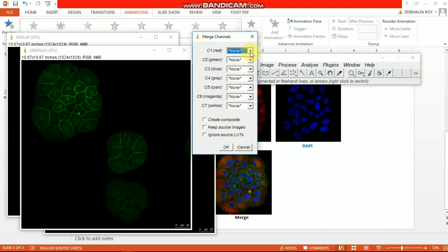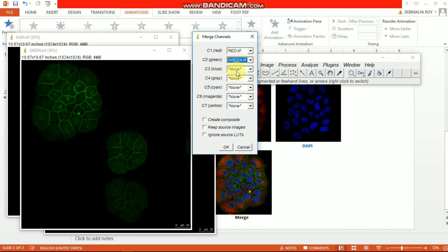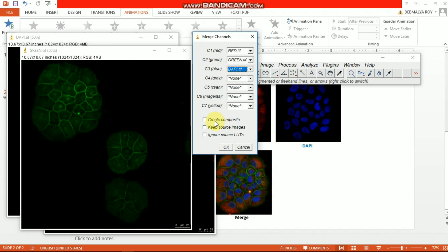Here is the red, so you need to select the red one. I already renamed my images, so the red one is red, the green one you should choose the green, and then blue should be the DAPI. By default, in some cases, the Create Composite box is checked. Remember that you should uncheck this box.